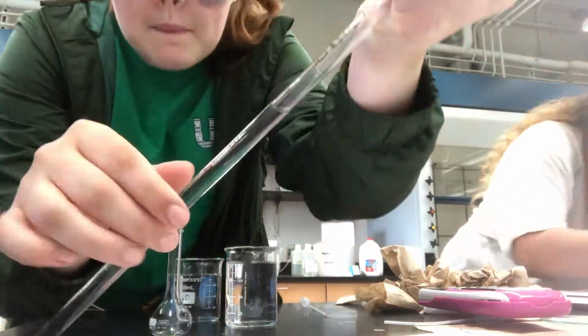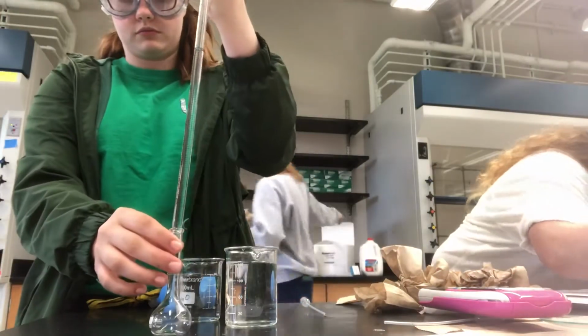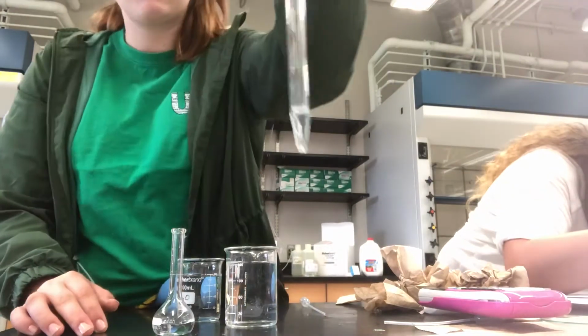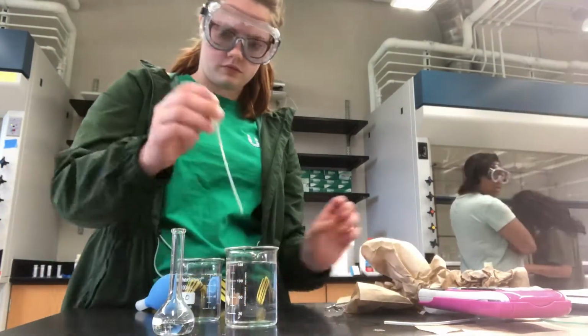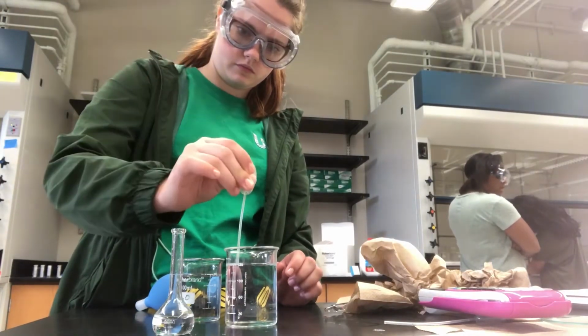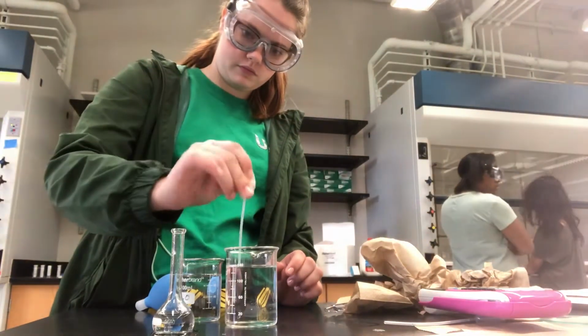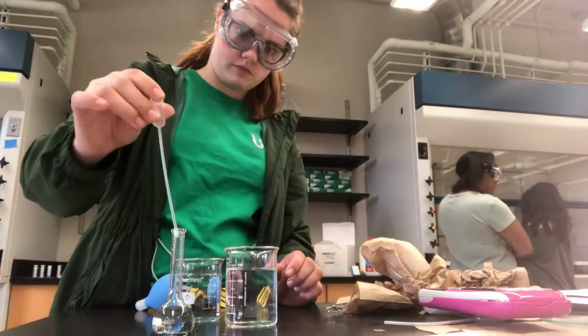The volume in all glassware should be measured at the meniscus, a curve in the surface of the solution caused by surface tension and attraction of water molecules to the container, or adhesion. To measure the volume of stock solution used, read the initial volume in the pipette, which in this case read as about 2.57, and the volume left in the pipette once some of the solution is transferred into the flask, which in this case read as about 9.82.